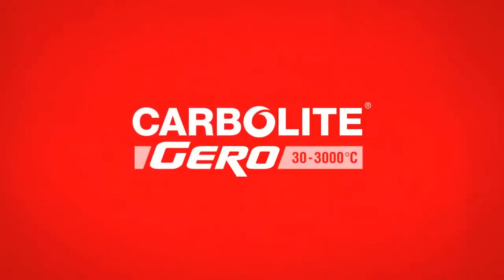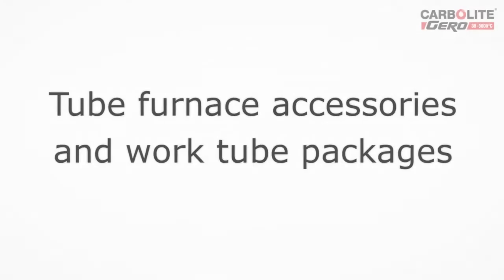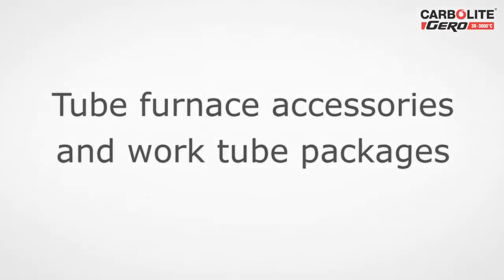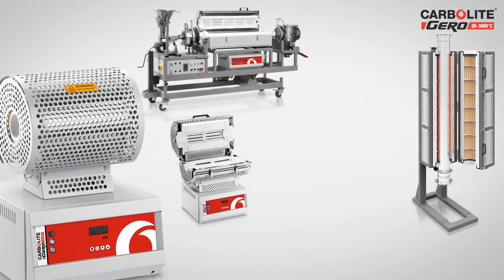Carbolite Gero is a brand synonymous with high-quality, leading heat technology for laboratory and industrial ovens and furnaces, ranging from 30 to 3,000 degrees Celsius. Our product range includes chamber and tube furnaces with a variety of options for operating under vacuum and with modified atmospheres. In this video we will demonstrate the accessory and work tube packages that enable our tube furnaces to work with different atmospheres.